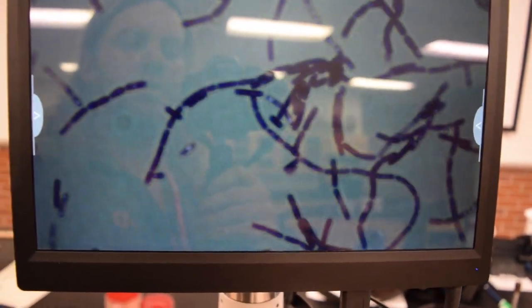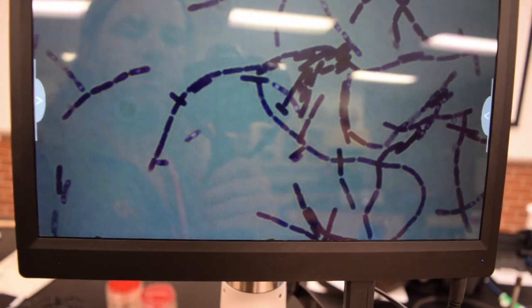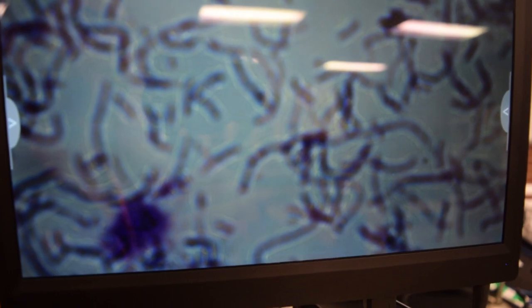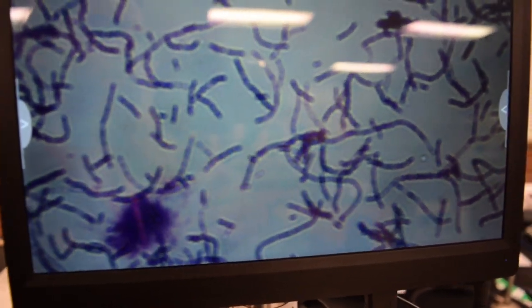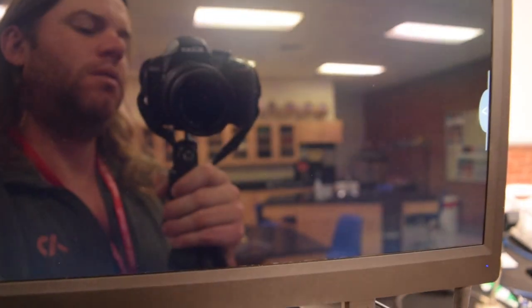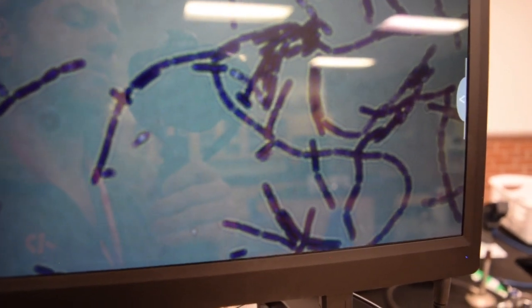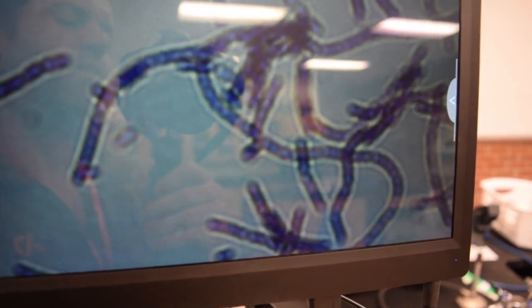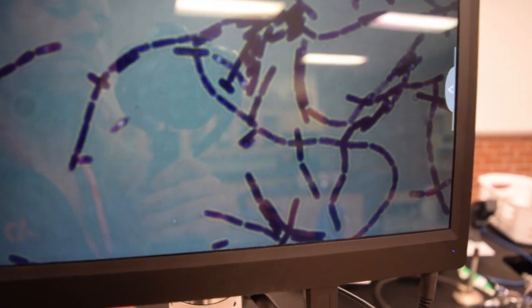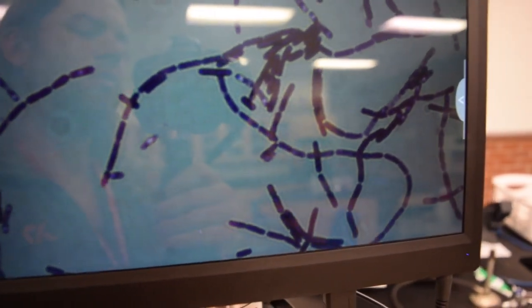Here I'm able to see the bacteria without oil. Here's 400 times magnified and here is 1000 times magnified. Now we can really see those bacteria - they're rod-shaped and chained, so this is a streptobacillus morphology and arrangement.